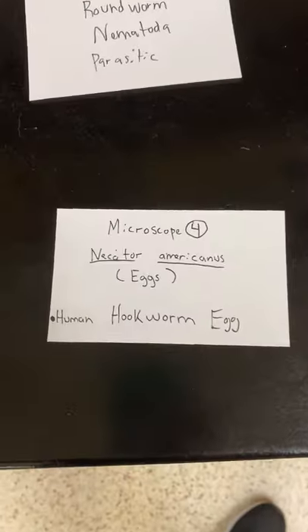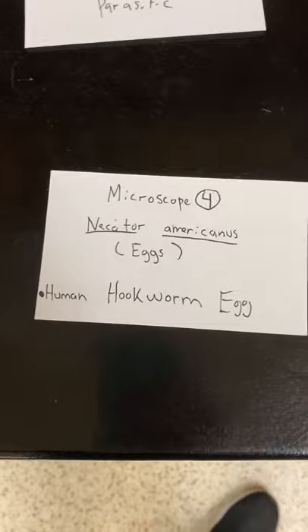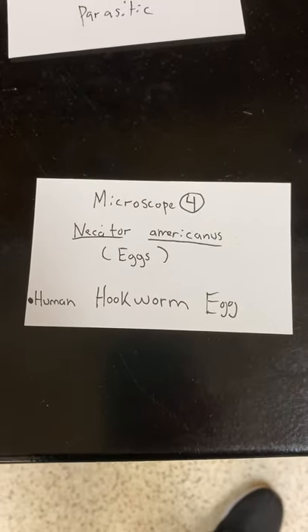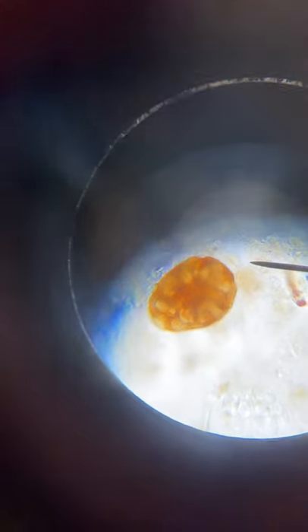Microscope four: these are human hookworms, but this slide shows their eggs. Similar to the dog hookworm but these are the eggs — roundworm, Nematoda, and parasitic. That's what their eggs look like.